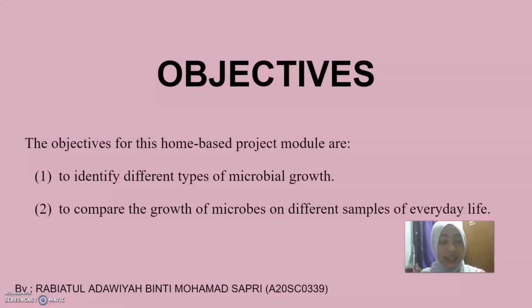So the objectives for this home-based project module are: 1. To identify different types of microbial growth, and 2nd, to compare the growth of microbes on different samples of everyday life.